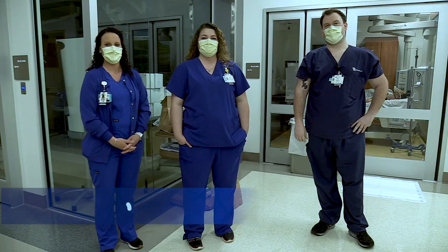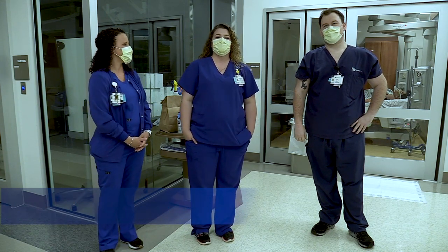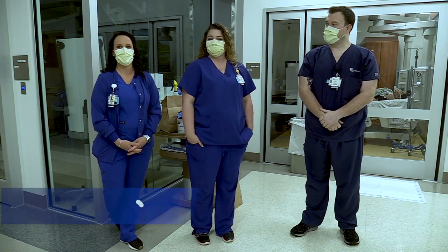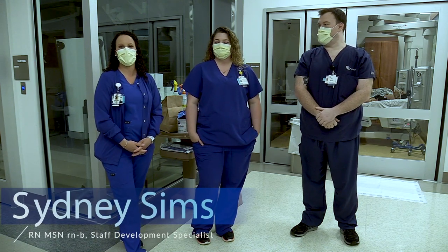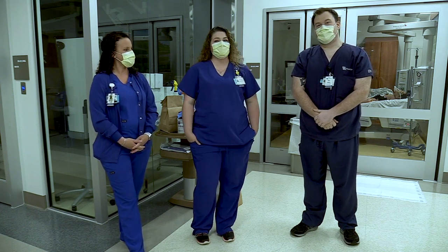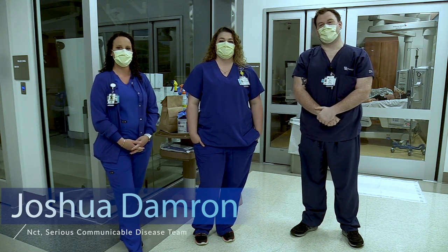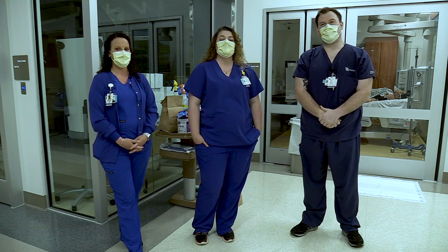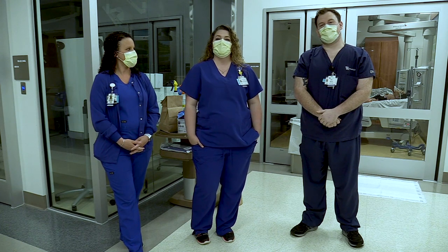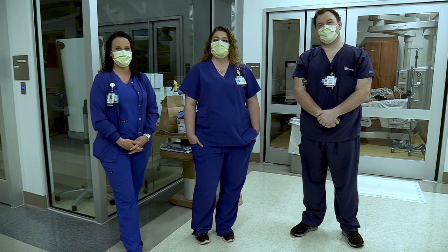Hello and welcome. I'm Amy Richardson at UK Healthcare, a staff development specialist who works with the Serious Communicable Disease Task Force. I'm Sydney Sims, also with staff development and part of the Serious Communicable Disease Task Force. I'm Josh Dameron, with the Serious Communicable Disease Task Force for three and a half years. Today we're going to go through donning and doffing and show you tips and tricks on how to keep yourself safe and prevent the spread of COVID-19 or any other serious transmittable disease within the community.